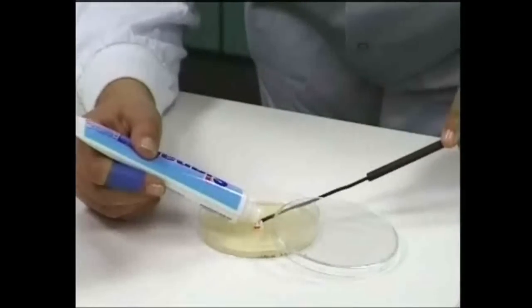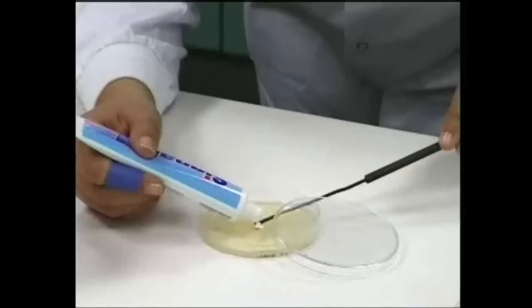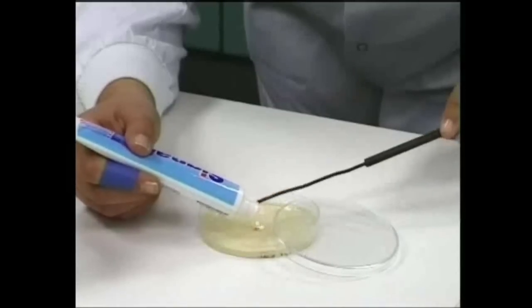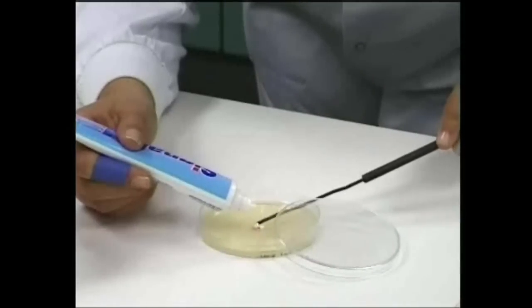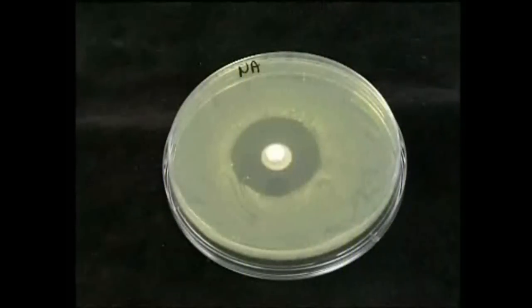If the reagent to be tested is solid, it can simply be placed in the middle of the plate. If liquids are to be tested, wells must be cut into the medium and the contaminated agar plugs that are removed need to be disposed of appropriately.